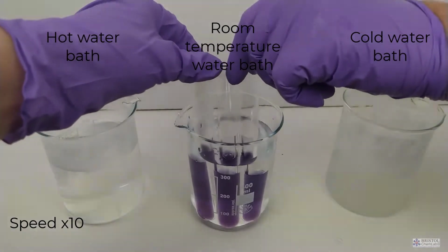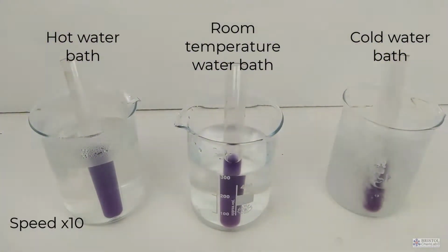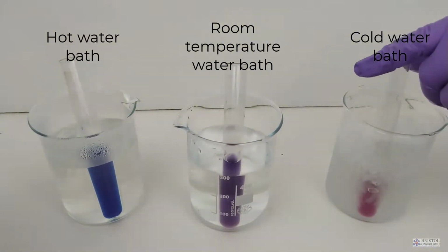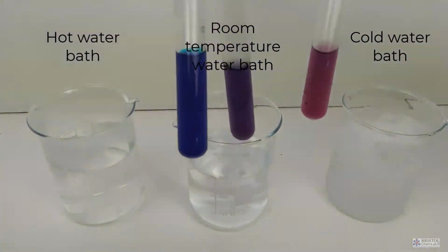Let's see what happens if we change the temperature. We have 3 different temperatures. Hot water supplying the heat, room temperature water as the contrast, and some ice cold water, the cooler part, the lower temperature. With time you'll notice there's a color change.